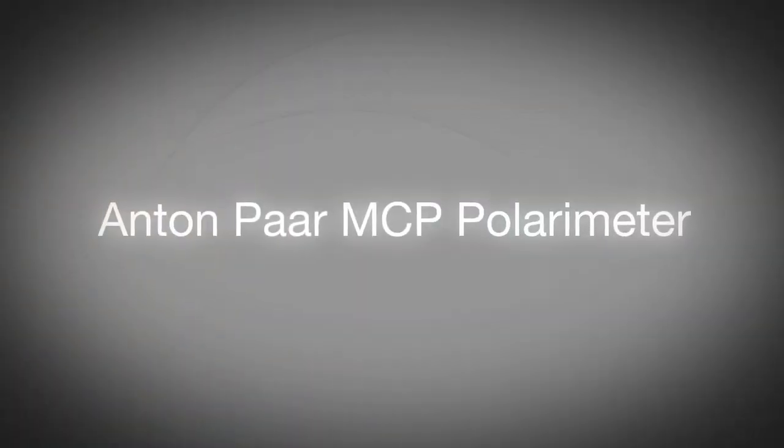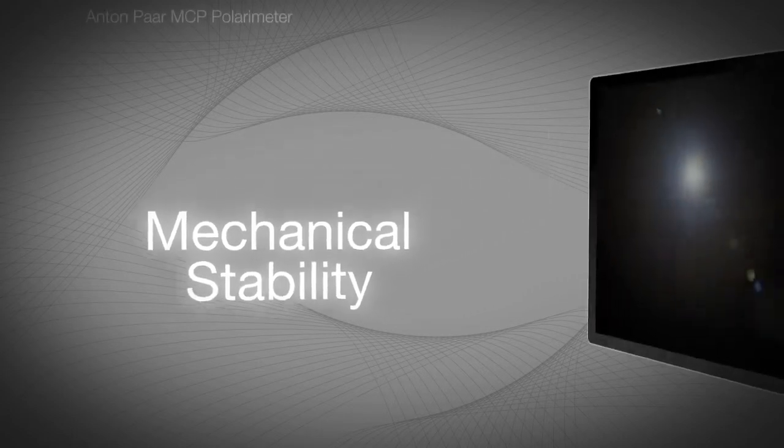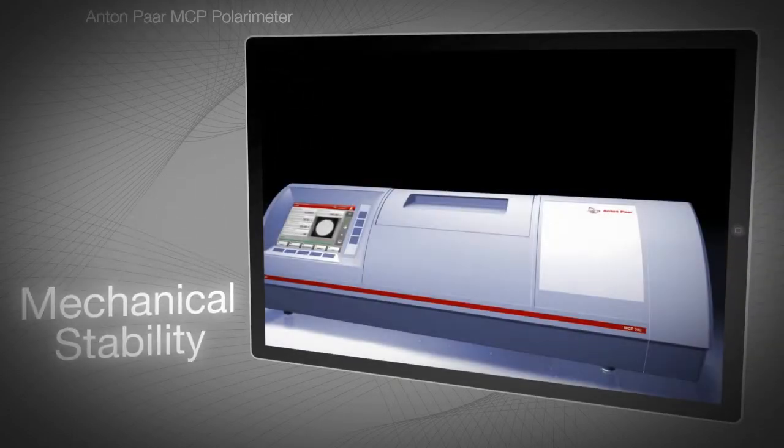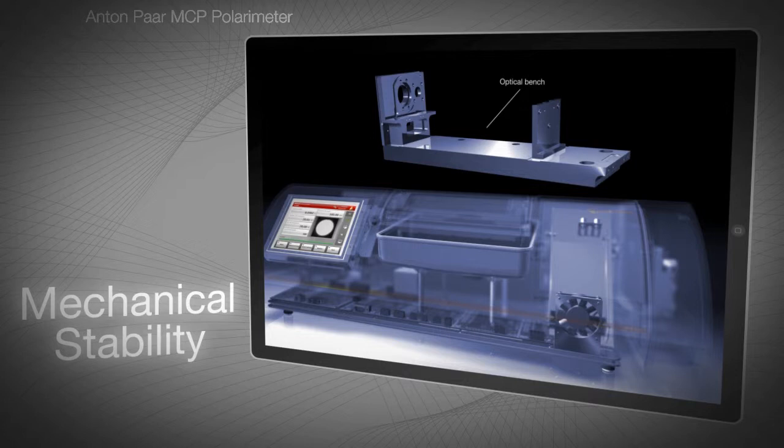The MCP series of polarimeters is produced by Anton Parr, a global company renowned for manufacturing high-quality instruments for measurement and analysis. This video focuses on the mechanical stability of MCP polarimeters. Much technical progress has been made in polarimeter electronics and software. However, in order to measure small changes in angle — up to a resolution of one ten-thousandth of a degree — you still need state-of-the-art mechanics.